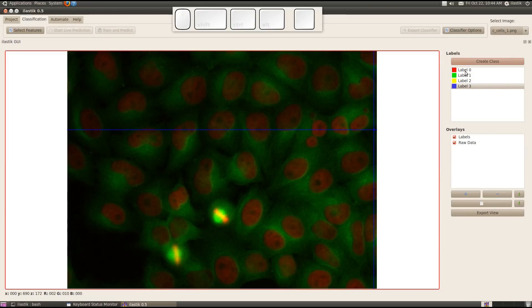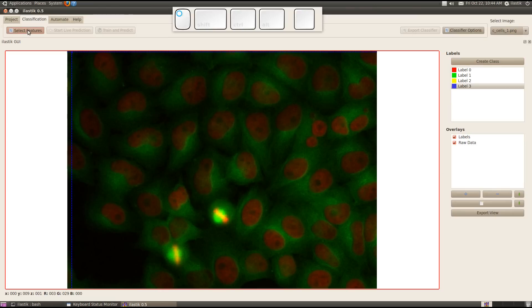Before we start labeling and learning these four classes, we have to compute some image features. I can select image features in the classification tab by pressing this button. There are four predefined groups for image features: color, edge, orientation, and texture.